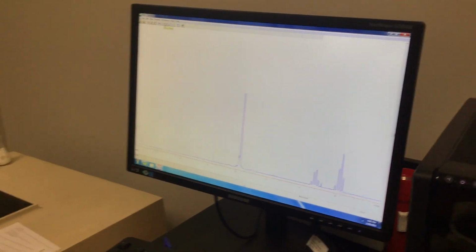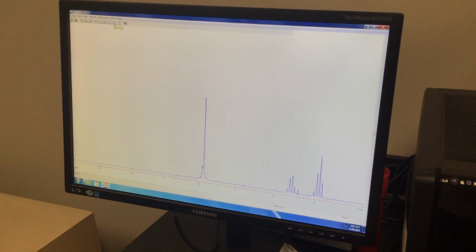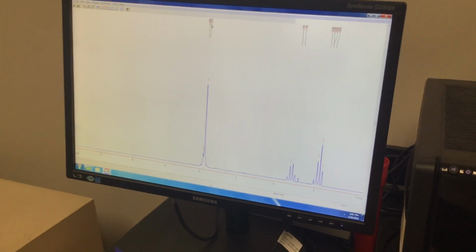So we already looked at the mouse phase and we put everything flat. What we can do next is hit peak pick, that's the furthest one in this group of 5, and it will select the ones that have the parts per million that we're concerned about the most. You'll see that they come up here to the top of the screen.